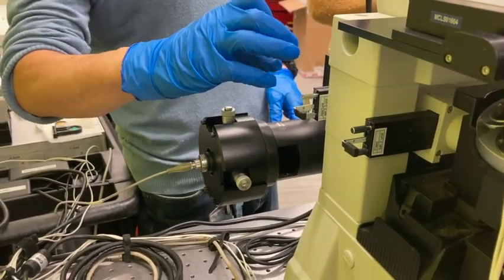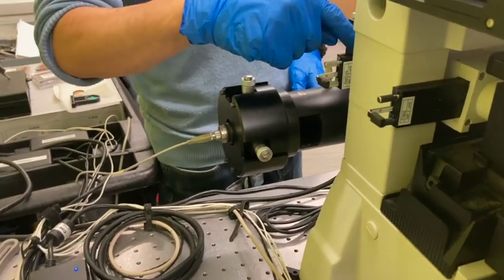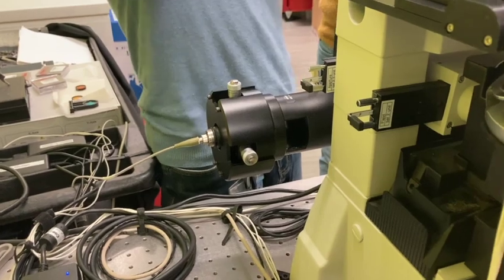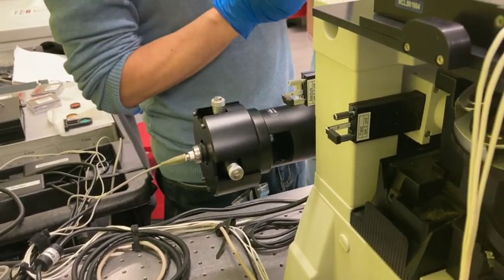You mean interchange these two? No. I mean you can change this to this, but you need to readjust it because the center of the aperture is not exactly the same. So yeah.